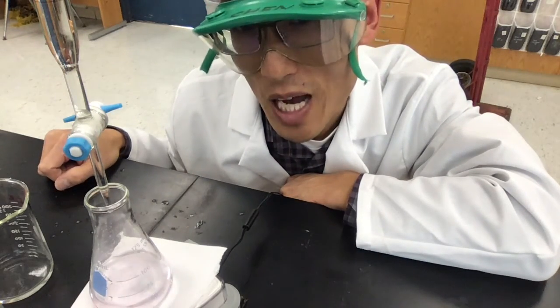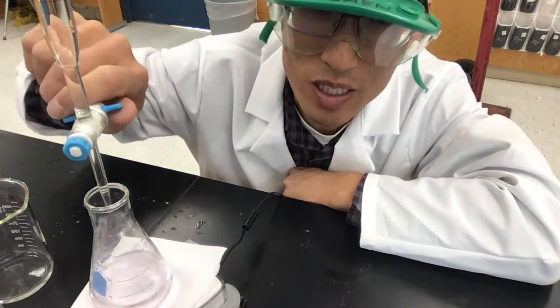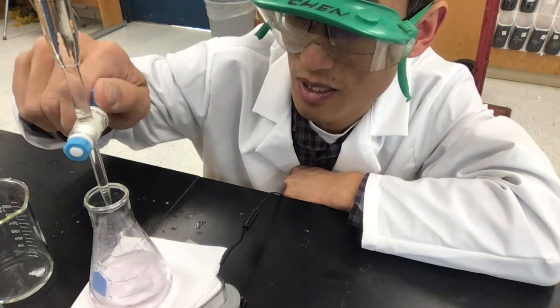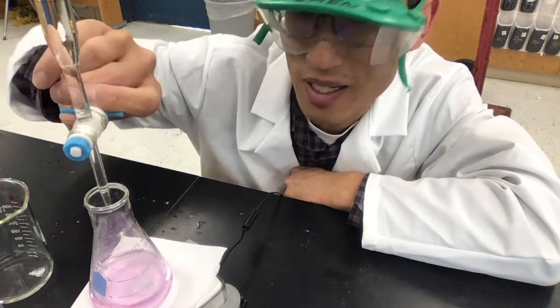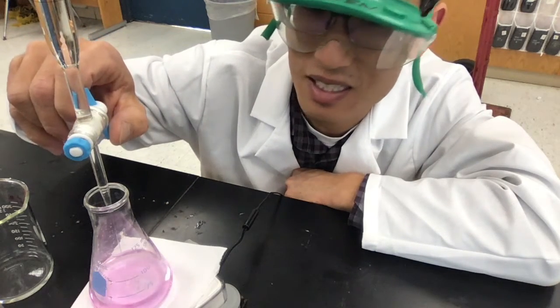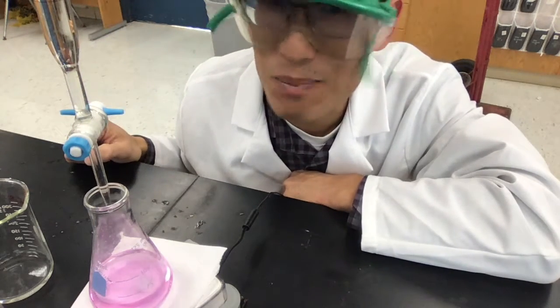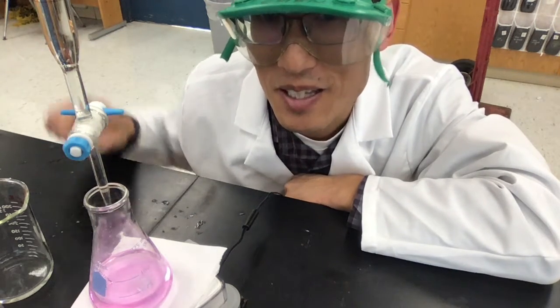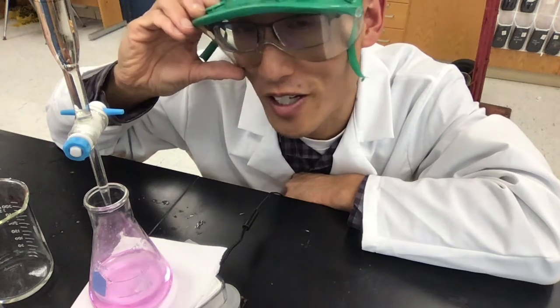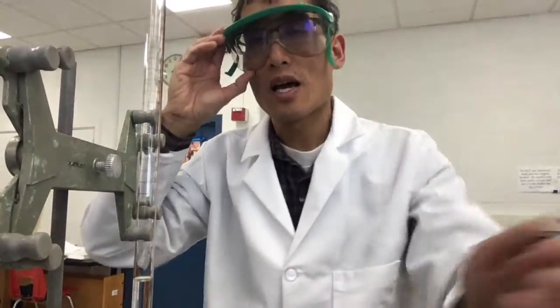What you don't want to have happen is blasting through. So let me show you what it looks like if you blast through it and go way past the titration. And it gets really pink. It is very pretty. Yes, it is. But it's not pretty for the chemistry teacher, because you look over and they say, well, you went too far, you have to do it over again. So that's the signal that you have to do this over again.